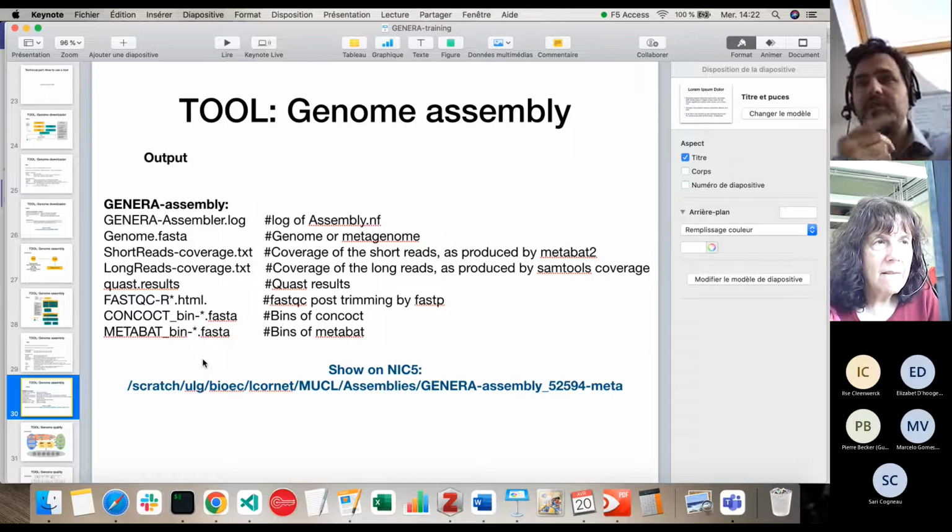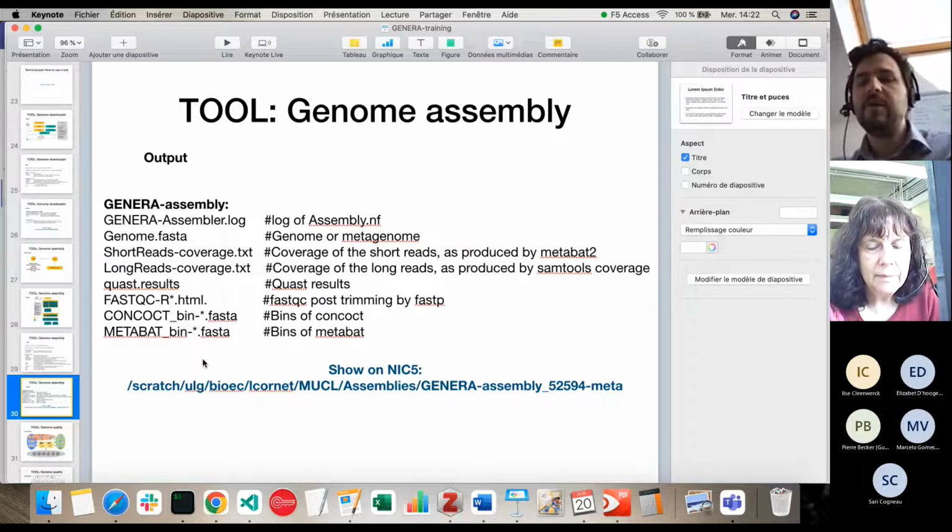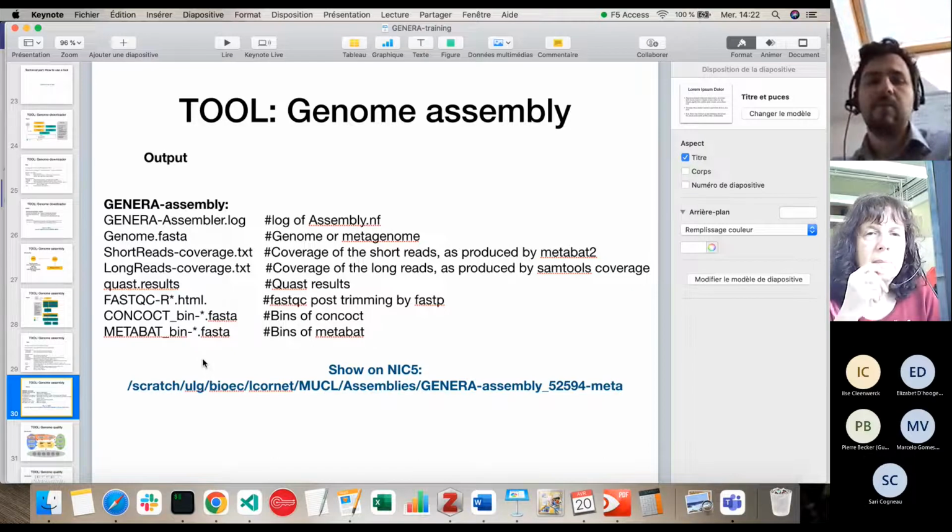Why I don't activate the automatic download is because you have to look at the NCBI metadata and see the technology of the genome. Is it a long-read genome? How many contigs do you have? And that's also a way to see this RagTag possibility.